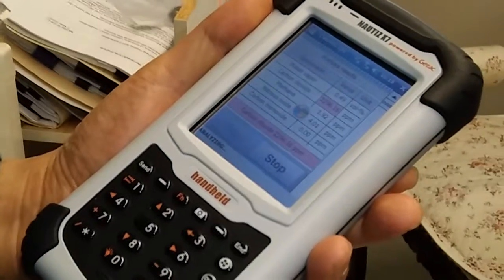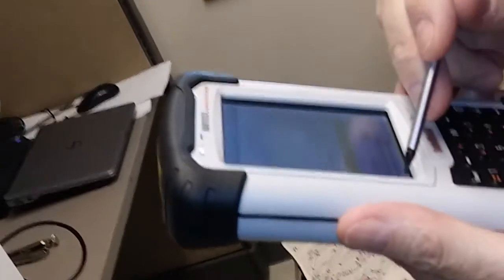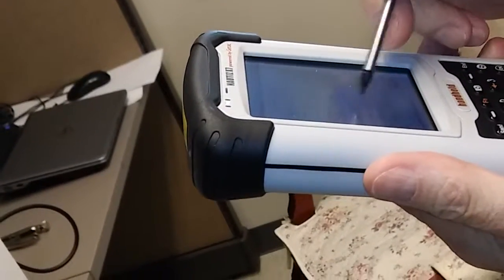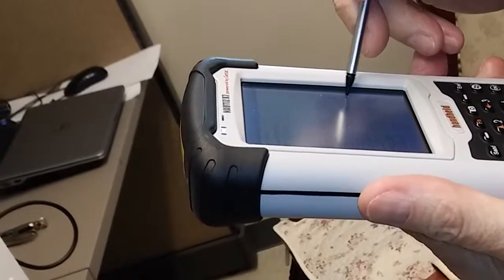That's a problem. So just to use the PDA only. Well, you would have to only use the PDA. Good. That's all. But also, supposedly you could stop it, okay? And then you go back to your file, and before it says the spectrum, I hit the spectrum, and it shows you.